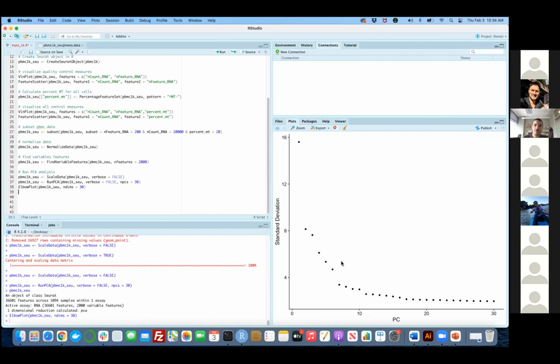So the variance that we found over here means that the first principal component is actually picking up the genes among the 2000 that are the most variable ones. And most of these are independent. Basically, each of these principal components will be representing some different part of the correlated genes in the list of 2000. Let's say that you have some 20 or 30 genes that are correlated to each other that have the most information. That is going to be picked up by the first principal component. So basically, you have the same amount of information in one variable instead of using 30.